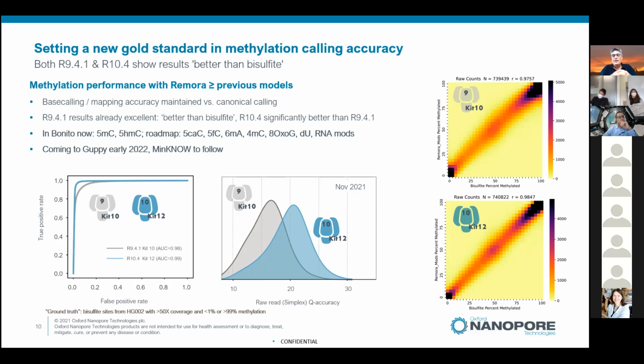Mike, hopefully we'll talk about the new base caller that's coming. It's not here yet, but we've even got an improvement on Guppy.